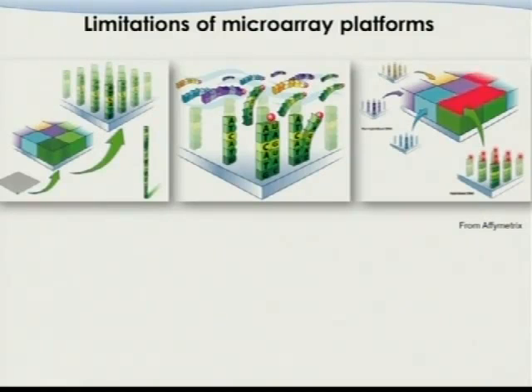And the next step is we put those RNA molecules, which can be changed to cDNA or other forms of molecules. You can see each individual molecule here has a small red hat there, right? Which is the fluorescent or other type of labeling. And if there's a molecule that hybridizes to this region perfectly, it will stick there. But this one will not come here, it goes somewhere else.